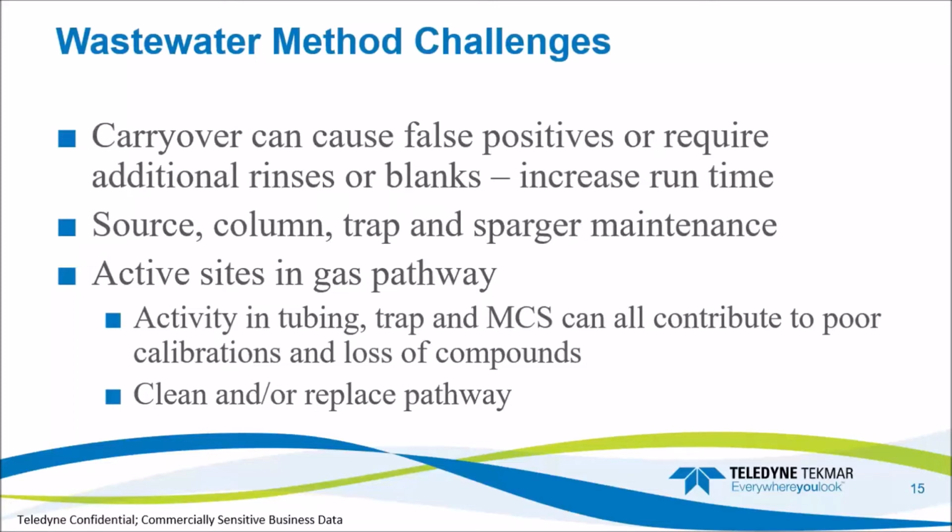Additionally, if a sample is a sludge or is oily, methanol rinsing can help to remove those sources of carryover and help clean up the sample, like between samples. Just as important for wastewater analysis are active sites in the gas pathway.